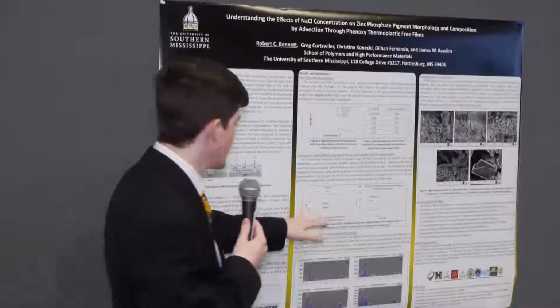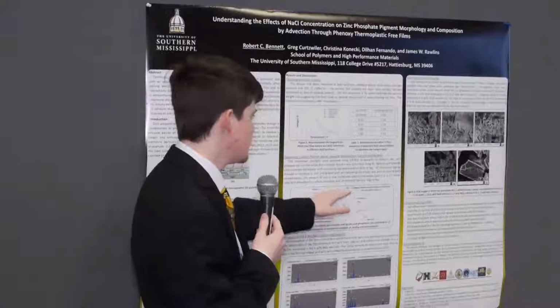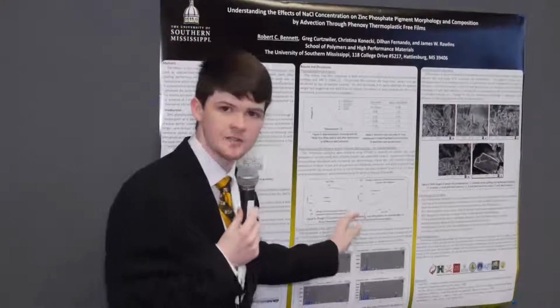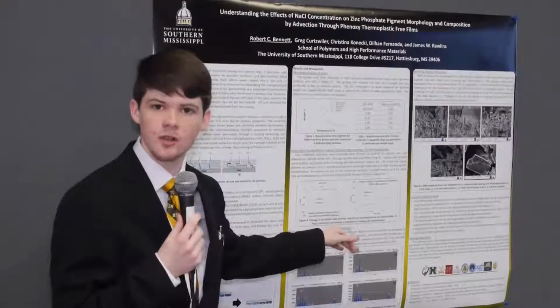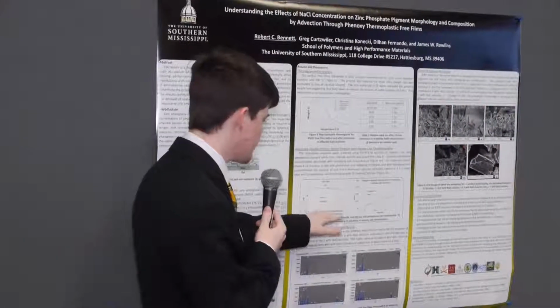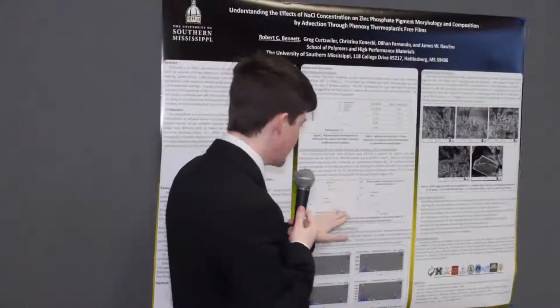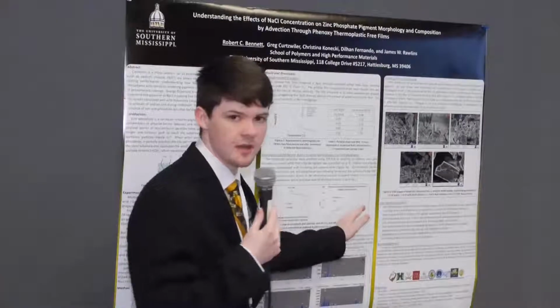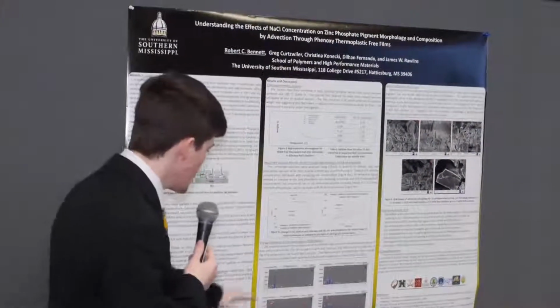within the coating. Now, we performed ICP and IC to actually look at the exchange of those ions from the solution into the coating and from the coating back into the solution. So as salt concentration increased, more sodium and more chloride left out of the solution into the coating, and more zinc and phosphorus left out of the coating into the solution.